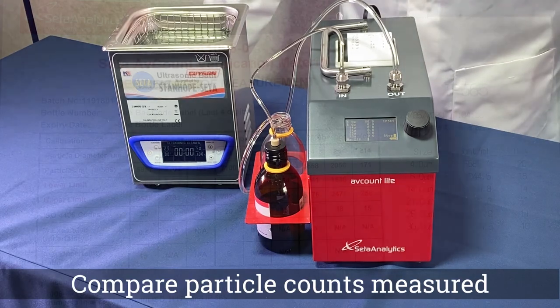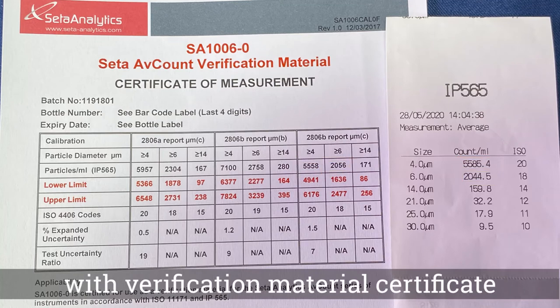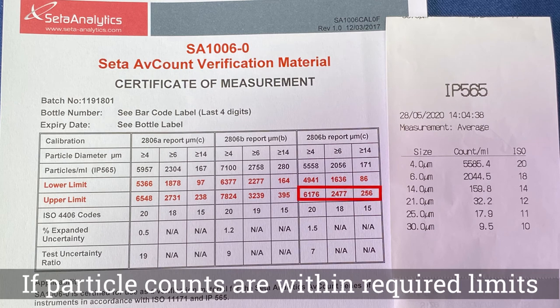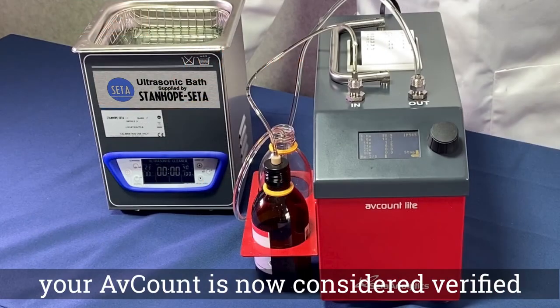Once completed, compare the reported results against the verification material's certificate of measurement. If the particle counts are within the stated upper and lower limits, clean the instrument with heptane. Your Avcant light is now considered verified.